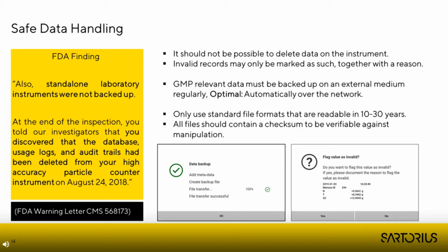With a reliable instrument in a regulated environment, it should not be possible to delete data on the instrument under normal conditions. Data that is not correct, for example, because something was weighed in incorrectly, should only be marked as invalid together with a reason, but never deleted, so that everything remains traceable.